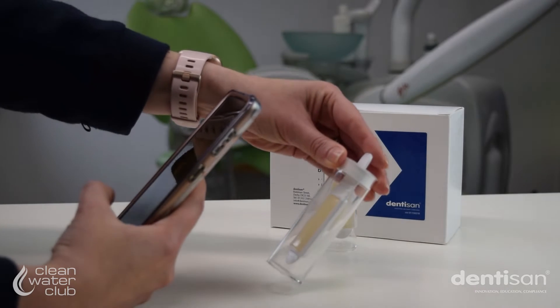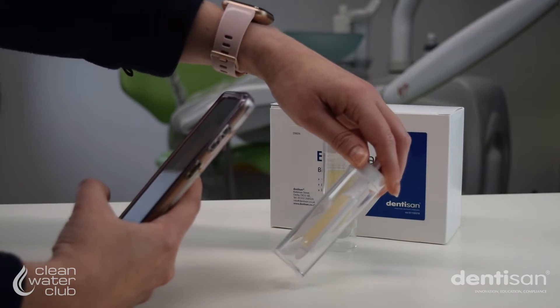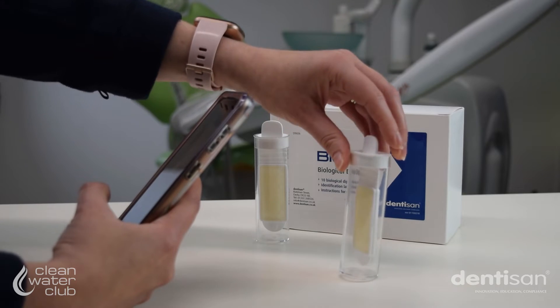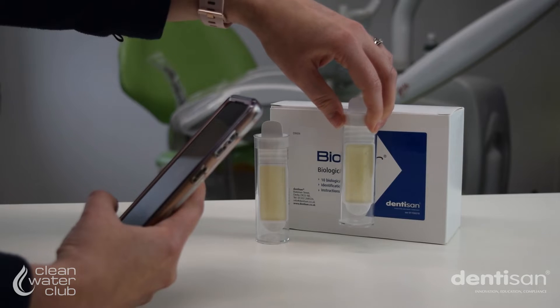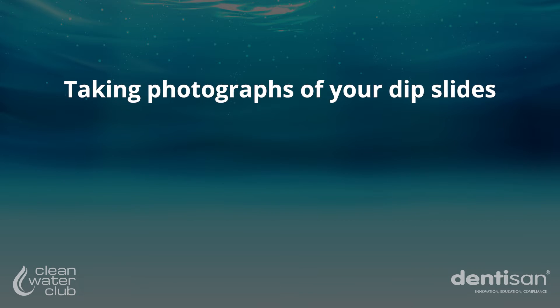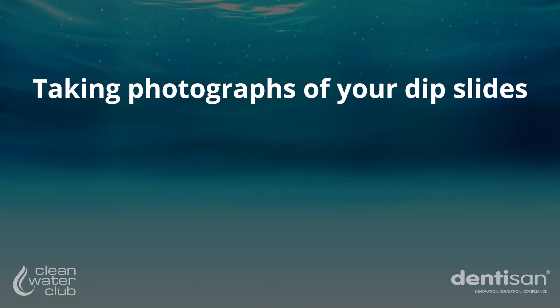Once the required incubation time has been reached, photograph each side of the paddle for each water test. One clear photograph of each side of the dip panel is required for each sample, so that's four images for each chair.